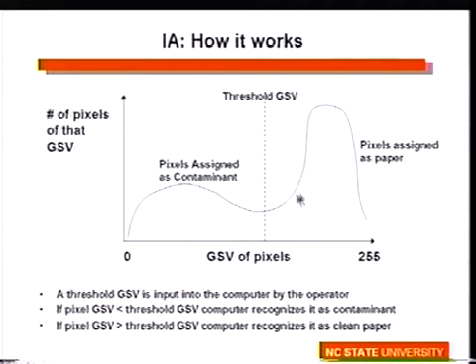And so we don't really get this nice, neat looking minimum here at all. It's very difficult to figure out where we're going to put that threshold grayscale value. So 80% or some fraction of the average grayscale value is one way to make it an objective rule. But it may also cause us problems. It may not be the right way to do it.